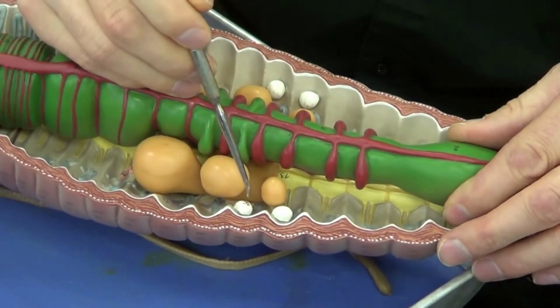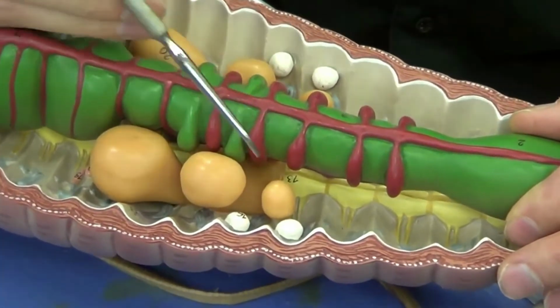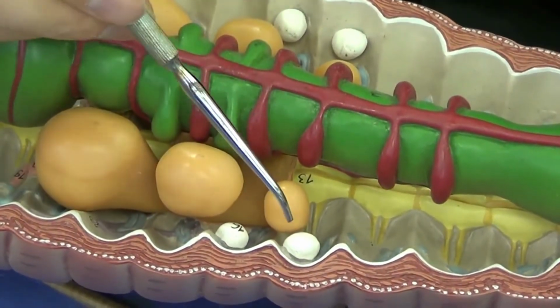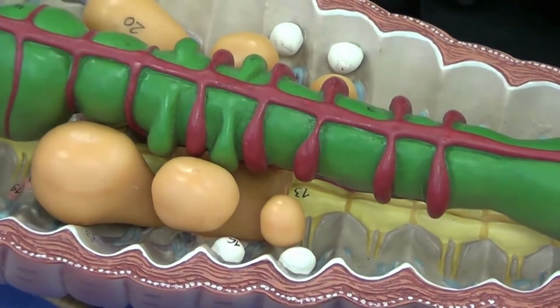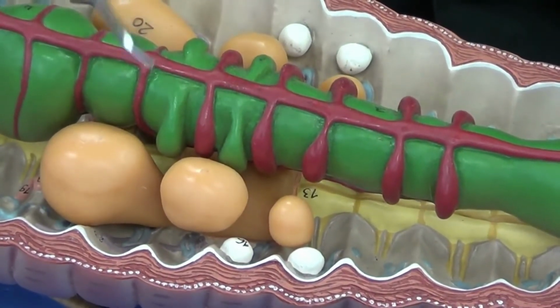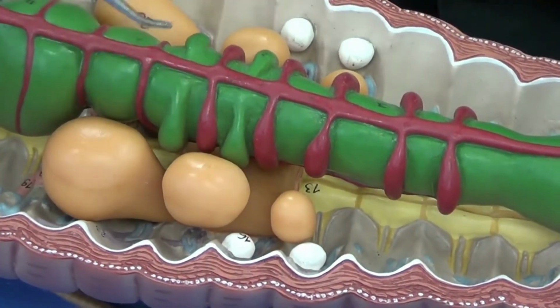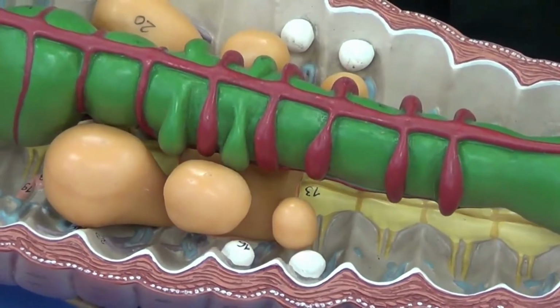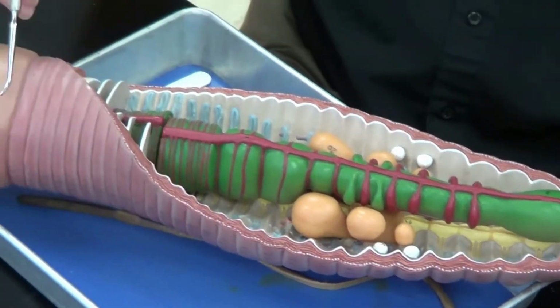And down here we have smaller structures, going to be similar in color, maybe a little bit whiter, but similar in color. And those are going to be your seminal receptacles. They call them receptacles because their job is to receive something. They actually receive the sperm of another earthworm, and they store that sperm temporarily until the earthworm is ready to fertilize its own eggs.